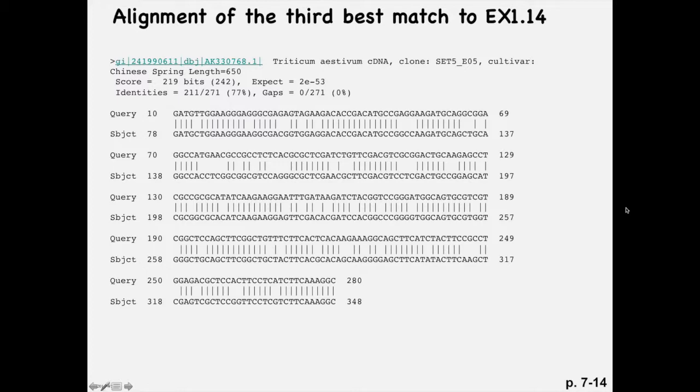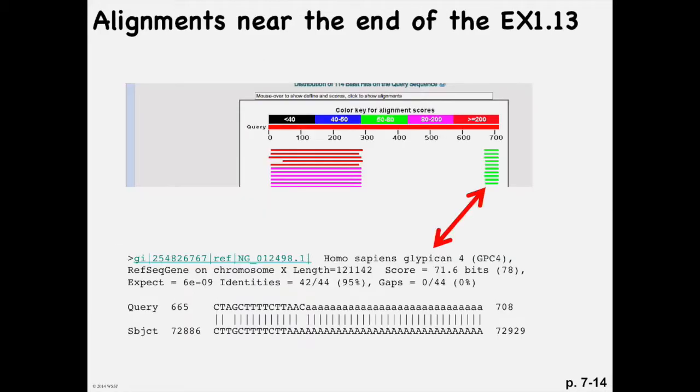So you look at the alignments, and you want to look for an actual protein name. If you get hypotheticals, scroll down and see if there are actual protein names listed later, because you might get good matches, they're just not the first ones. So here you see that the poly A tail is matching in this region. Does that mean that this is a match to the rest of our protein? No. If you could see, it doesn't match this whole area, but there is a gap here. So near the end, you're going to get matches just because of the poly A tail.